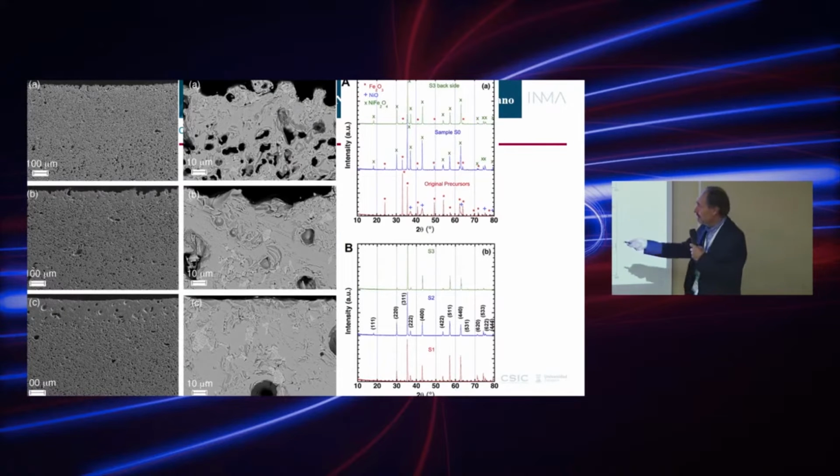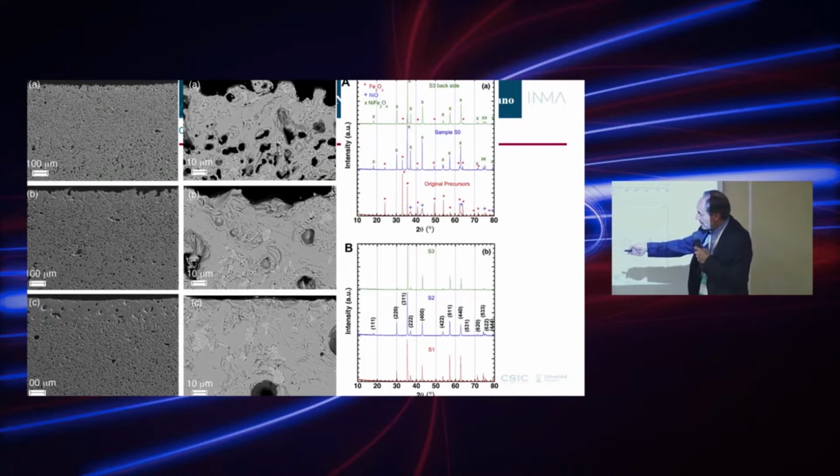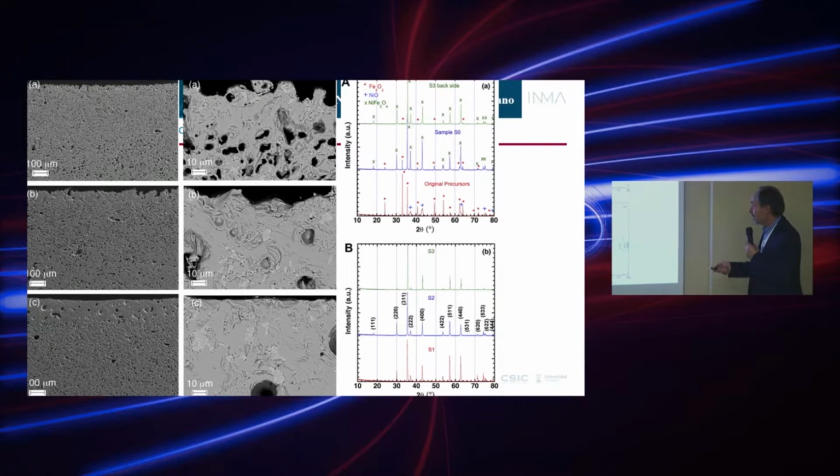This is the same that I wanted to show you from before. This is what is published in the paper, and maybe you cannot see too well because of this light, but you can see how the melt thickness has left a much thicker layer in the material affected, and also a much better surface finish. Thank you. Now you can see maybe a little better. This is the original one, then a low intensity condition, intermediate and high intensity conditions, and you can see the surface improves, and this is a sign of melting.